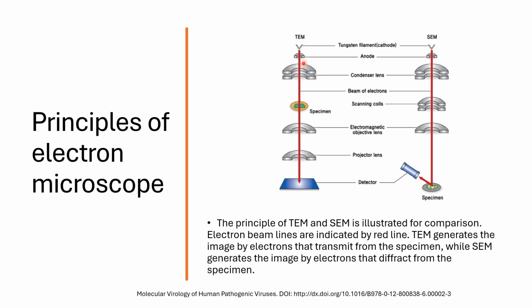TEM is a microscopic technique in which a beam of electrons is transmitted through the ultra-thin specimen, interacting with it as the beam passes through. TEM relies on negative staining of purified virus particles with an electron-dense material such as uranyl acetate or phosphotungstate, and images formed from the interaction of electrons transmitted through the specimen. The image is magnified and focused onto a layer of photographic film.